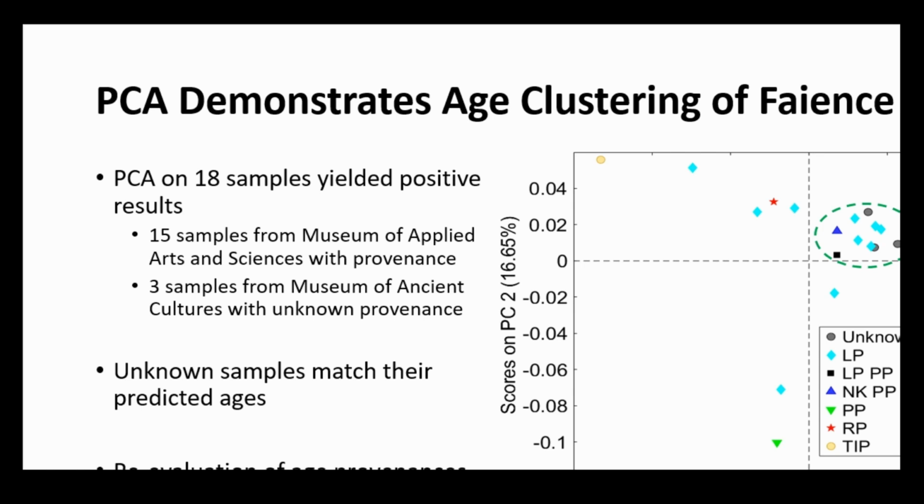But it did seem to work. They seem to cluster very nicely with the late period faience artifacts. So maybe the sticky note was correct. We're adding weight to the arguments of how to provenance faience.